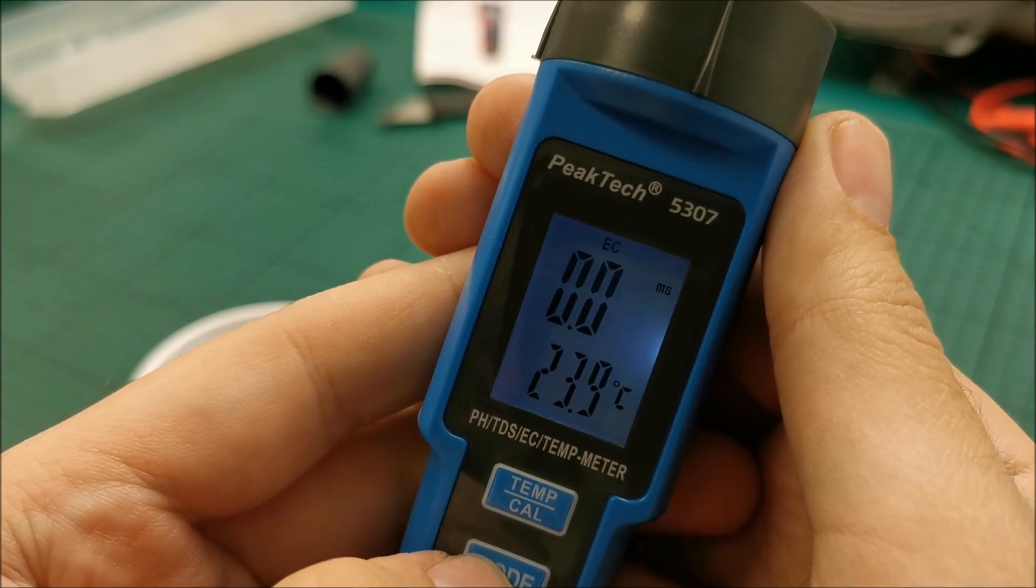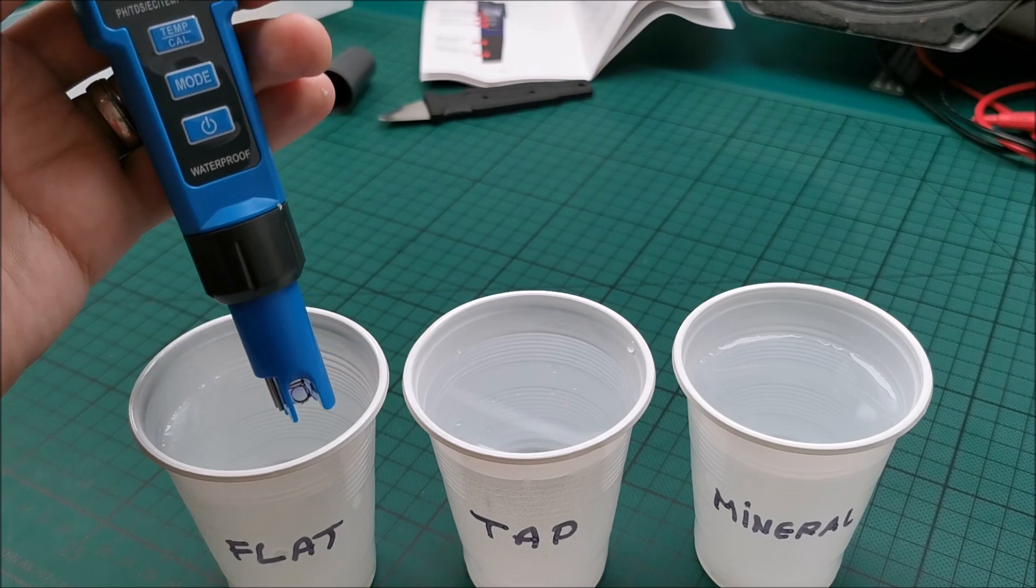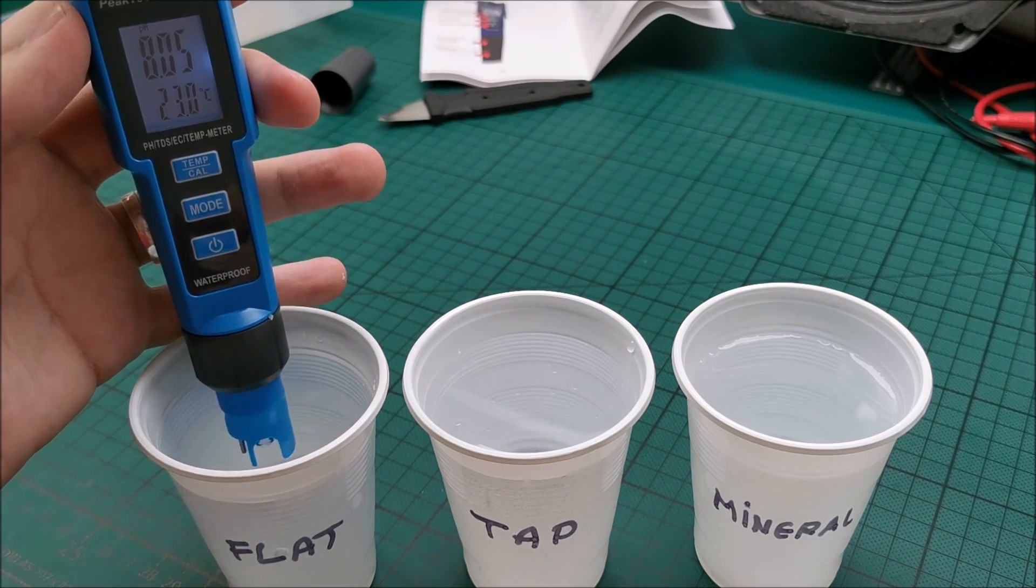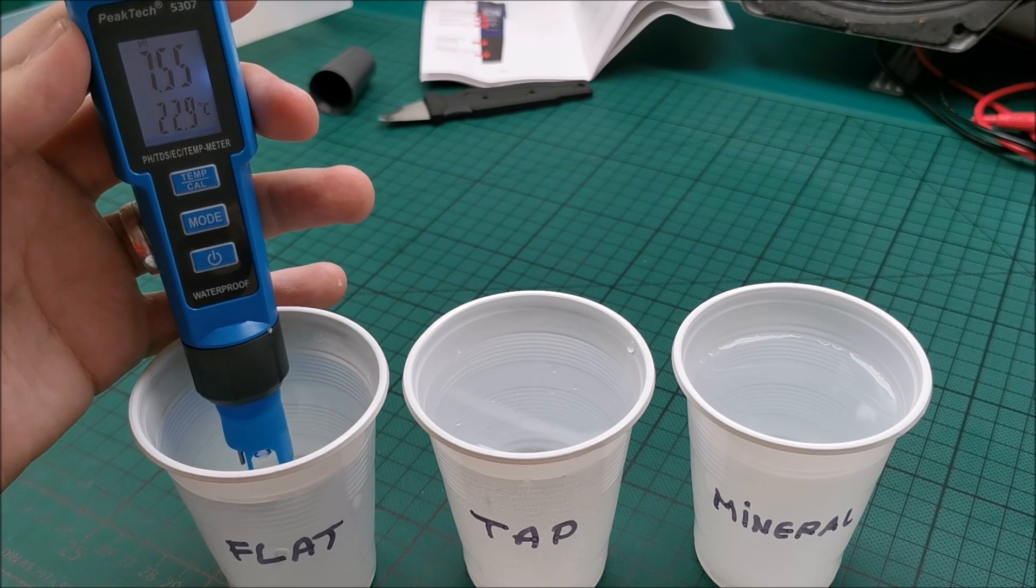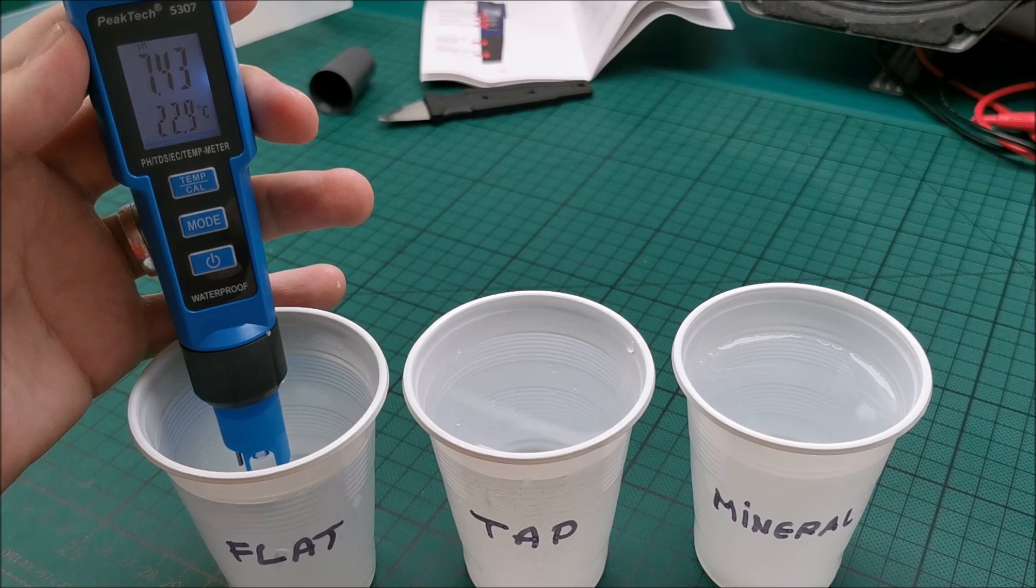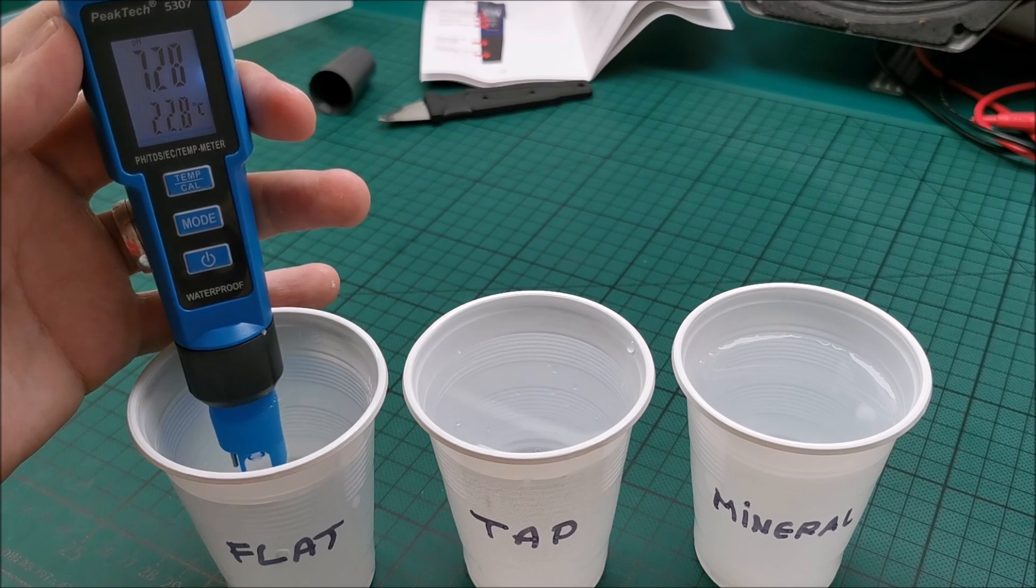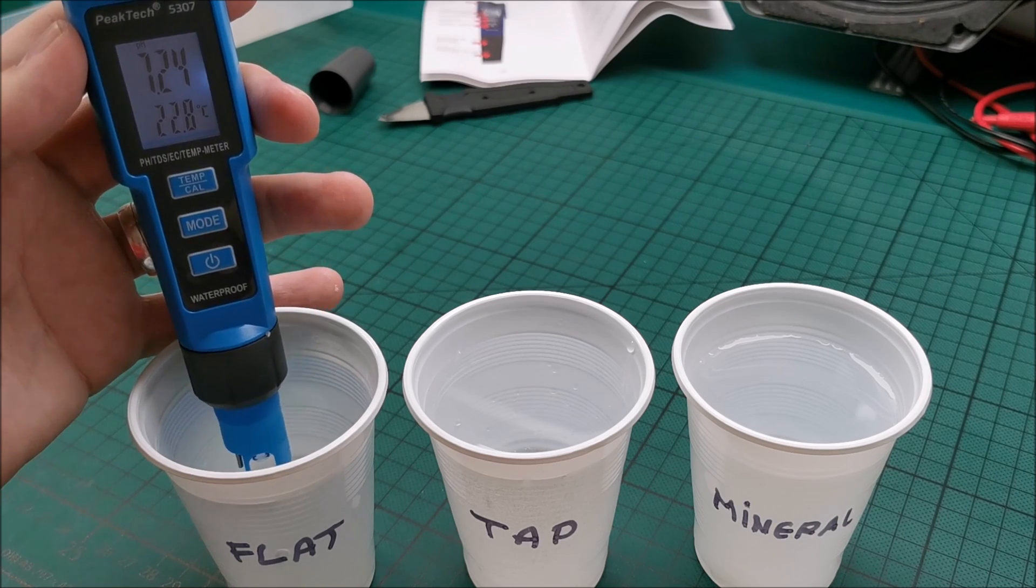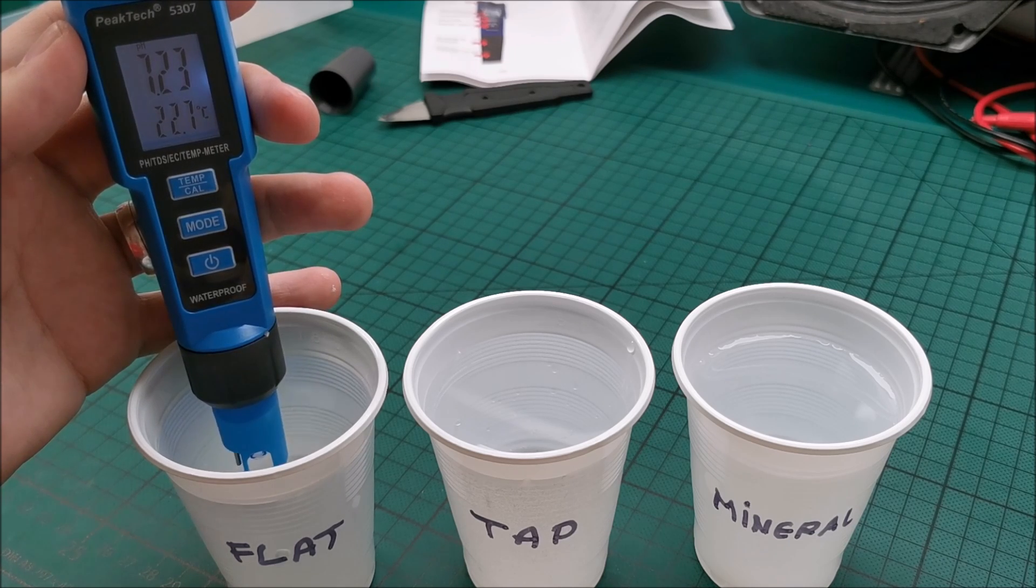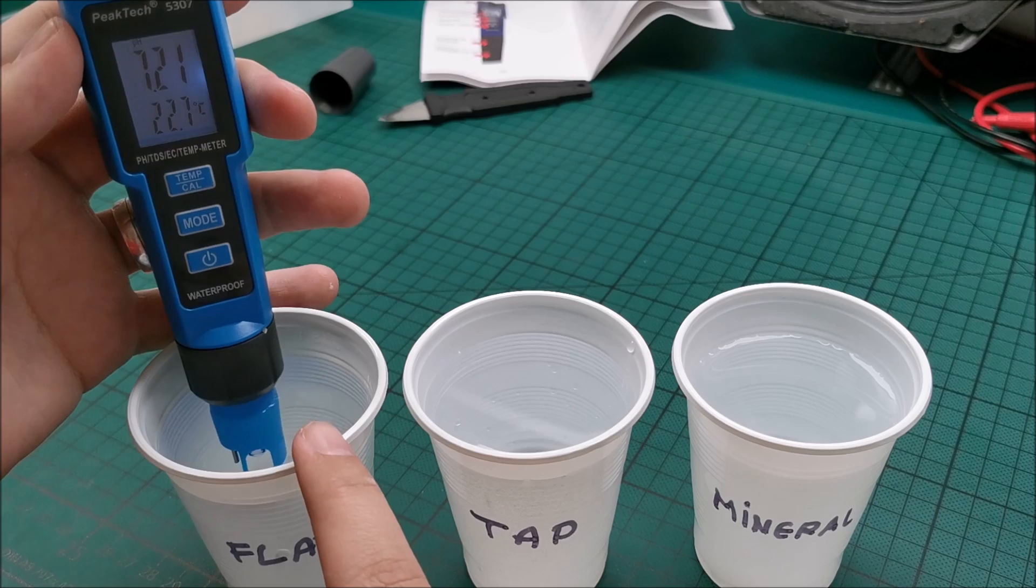From factory it powers in EC mode. So from mode you change it to pH and start playing around. This is flat water. And it's a bit basic. pH 7 is right smack in the middle between base and acid. It will settle at a point. Yes, normally you need to clean the tip with distilled water and then dry it up. But for what we are doing here, I think this is enough. So this water is pretty close to being right smack in the middle, which is good.